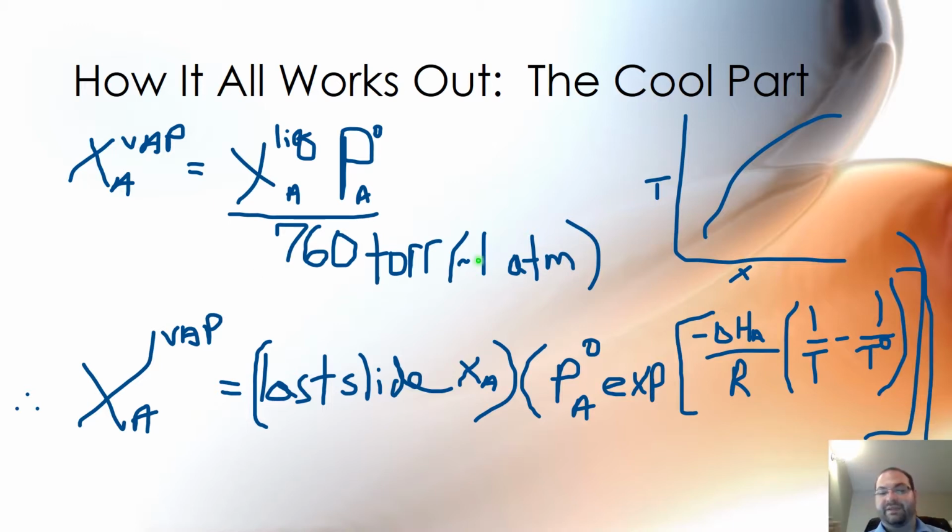We tend to use torricellis with this setup because we're talking about a 30 centimeter column here. I mean, it's not really big. You're talking about a small system. It's not a huge column. We're not going to measure things in pounds per square inch and pound-feet and all these different English units you hear about for pressure. We're not using pascals.